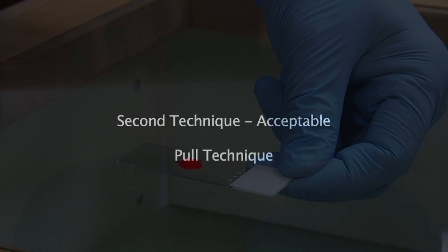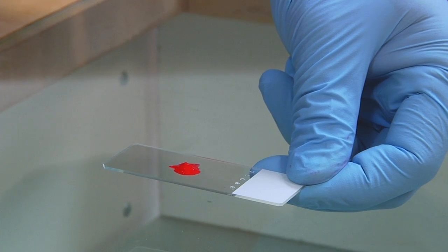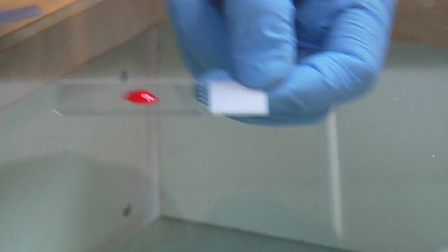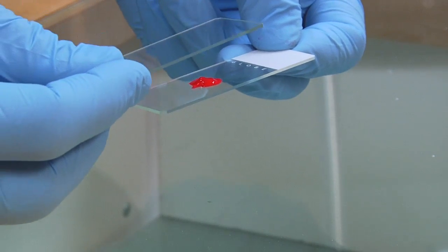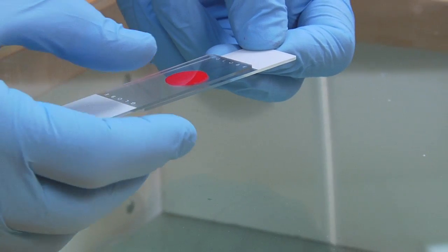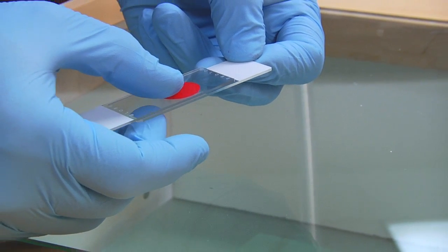The second technique of making slides is the pull technique. This works best for very bloody specimens. As you can see in this, the material is placed in the middle of the slide and the two slides that are going to be forming the smear are brought in contact with each other.